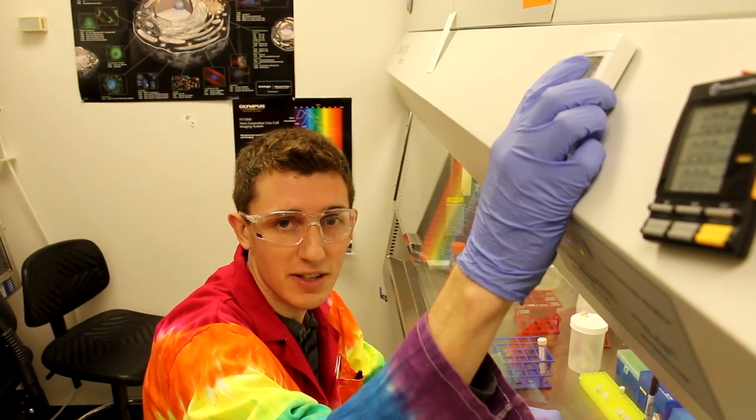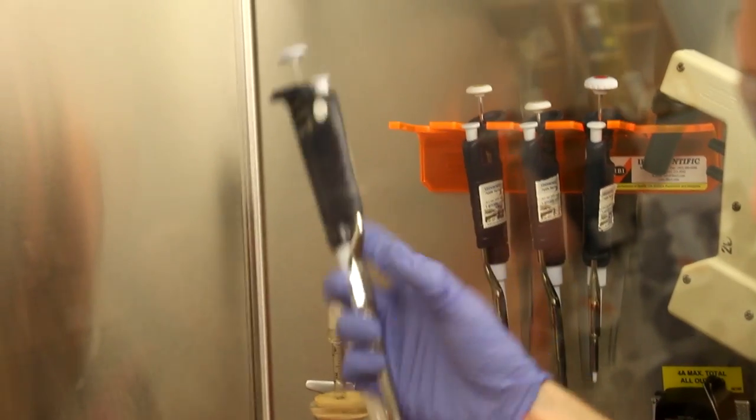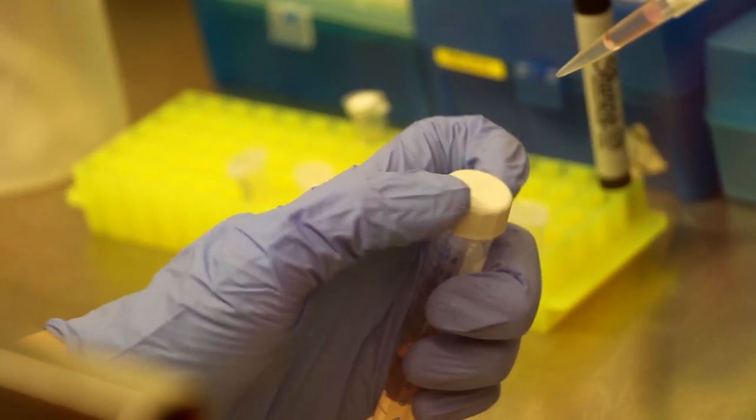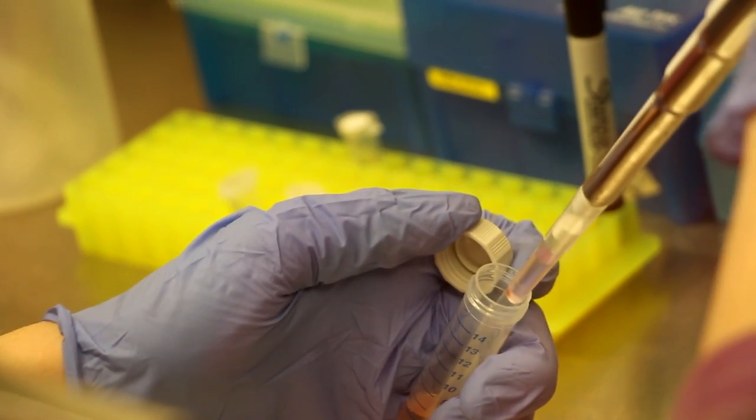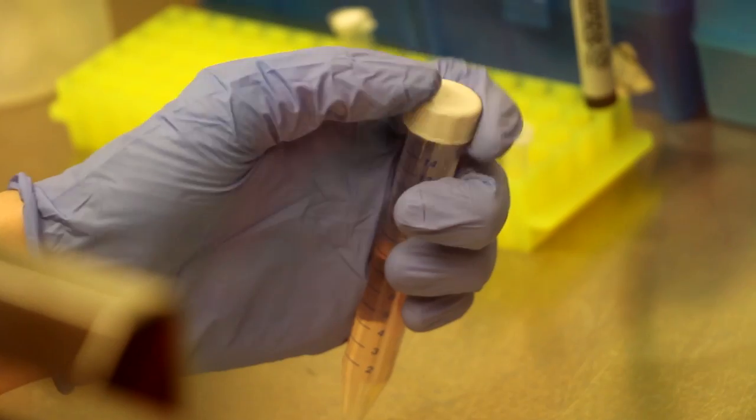At the end of your 5-minute incubation, you will then use a P1000 to transfer the entirety of your transfection reaction into your remaining growth media. Gently invert the tube about 5 times to mix the transfection reaction with your growth media.